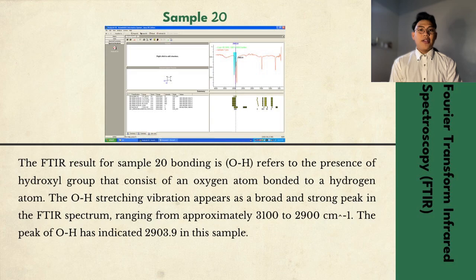When infrared radiation strikes a sample, an interferometer divides it into two rays, one traveling through the sample and the other serving as a reference. An infrared spectrum is created by Fourier transforming the resulting interferogram, which exposes distinctive peaks associated with molecular vibration and sheds light on the sample's chemical composition.